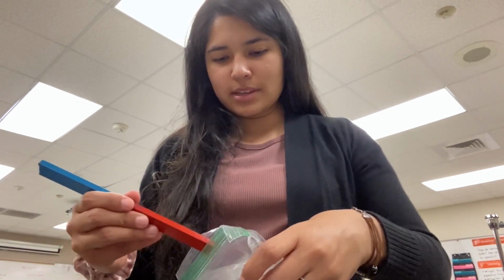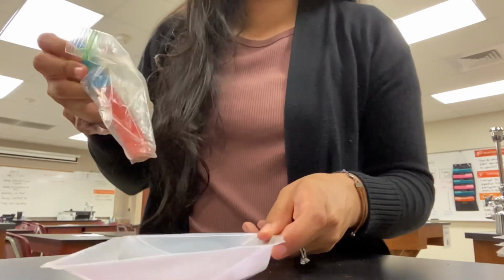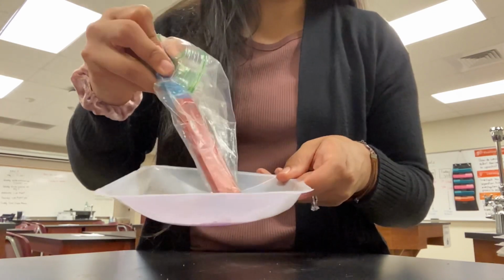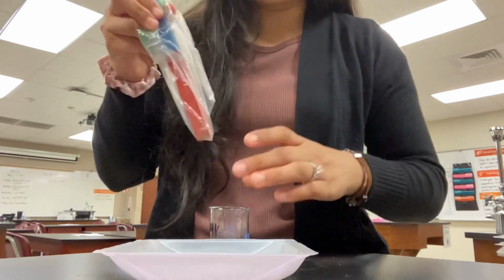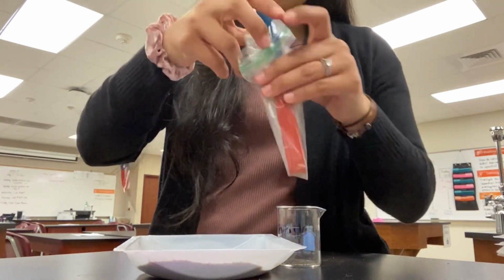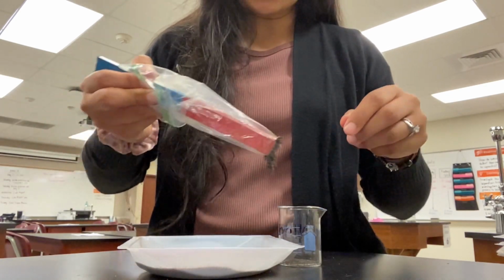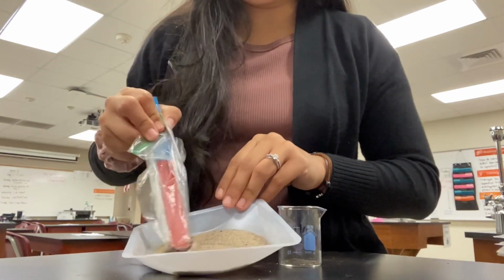Okay. So I'm going to take my magnet, and what I will do is separate that out. So we want to take the magnet, and we're collecting it. I'm going to use a different beaker to collect my iron. That's what I'm doing here. And this will take a little while because we want to make sure that all of the iron is out. And since it's so small, it's powder, it's going to take a little while. So that's what I'm doing.